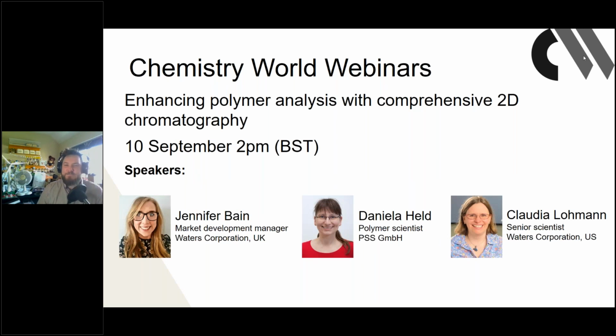We've got an action-packed hour coming up with three excellent guests, lots of interaction from you and some important take-home messages for you to learn from. So today we're looking at enhancing polymer analysis with comprehensive 2D chromatography. We're going to gain a deeper insight into polymeric structures by leveraging comprehensive 2D chromatography to make better informed decisions and accelerate your materials innovation.